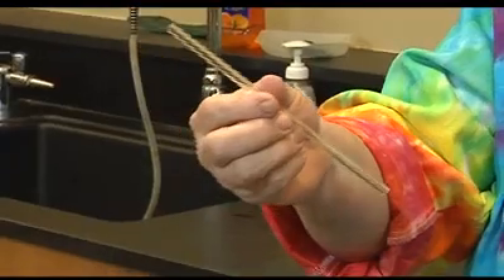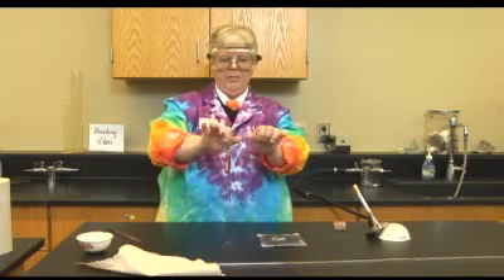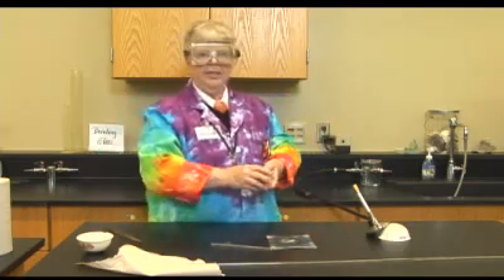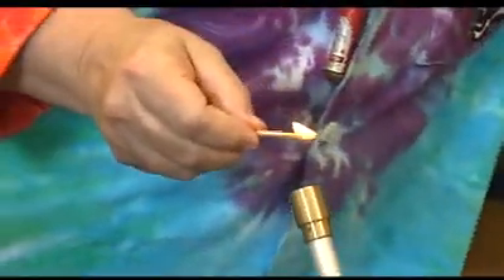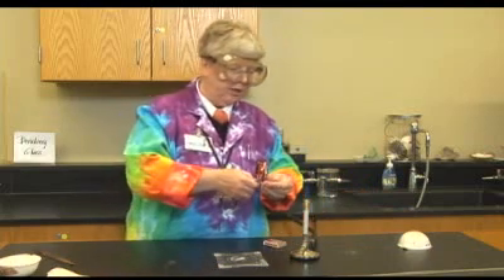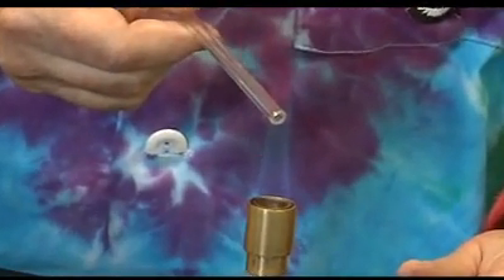I've got a nice little piece of glass just the right length, and I'm going to do two things to it: I'm going to fire polish the two ends and then bend it into a 90 degree angle. So right now I need to light my Bunsen burner, and that's a three-step process: goggles, match, gas.